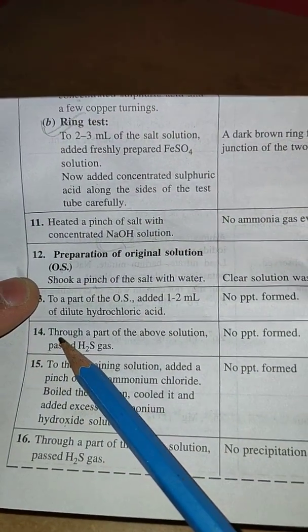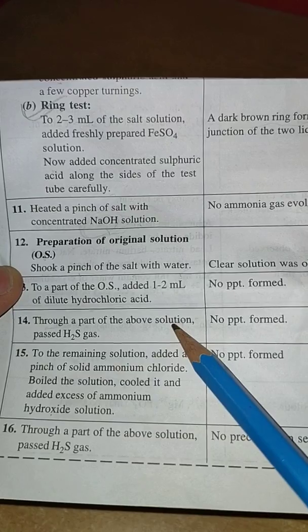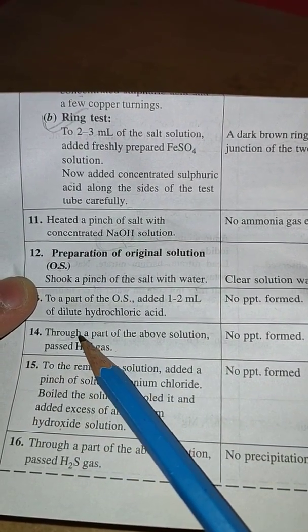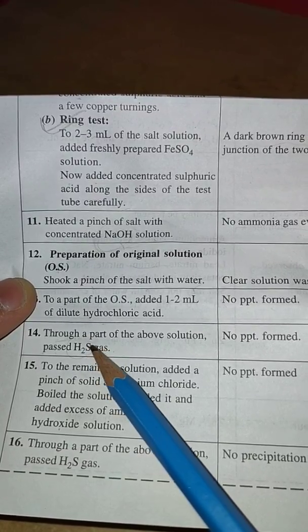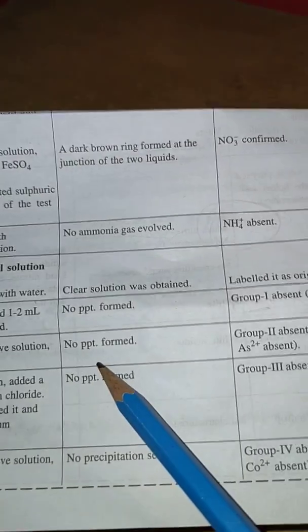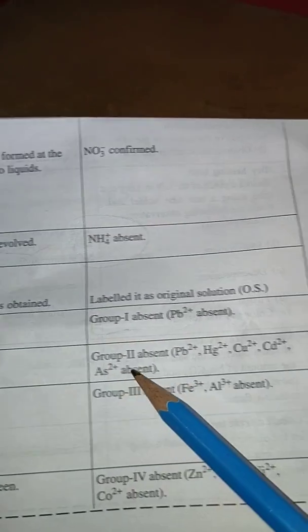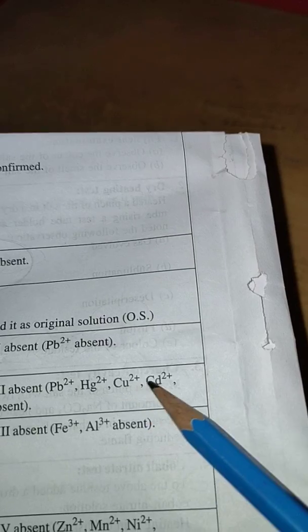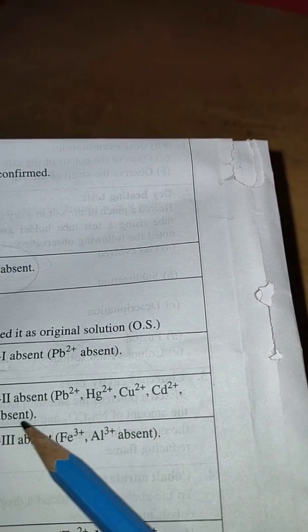Next part, that is 14th stage: through a part of the above solution pass H2S gas. I have already told you how to prepare H2S gas in the Kipp's apparatus. No precipitate formed. Group two, that is Pb²⁺, Hg²⁺, Cu²⁺, Cd²⁺, and As³⁺ is absent.